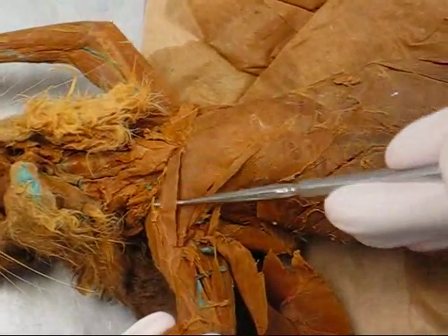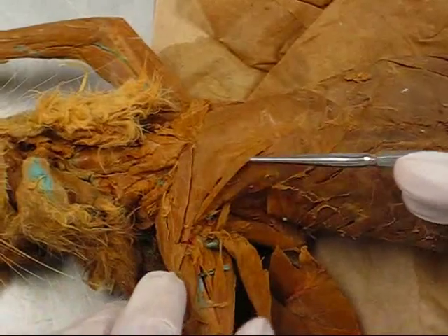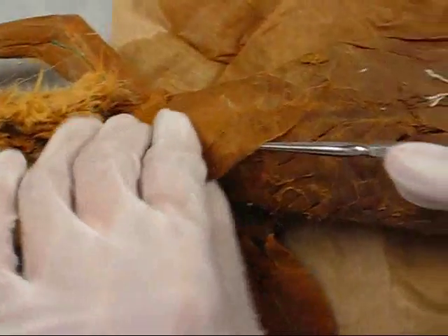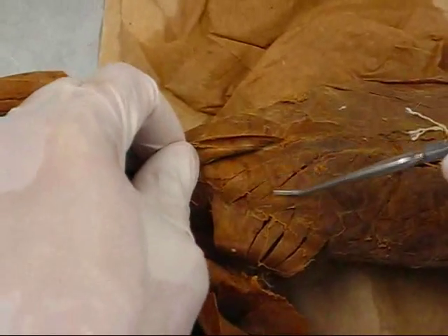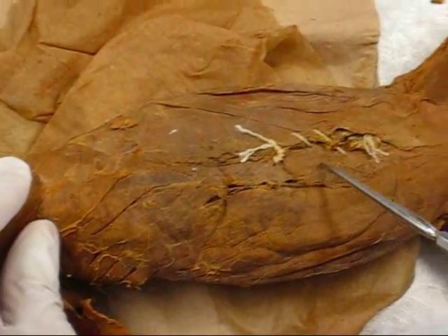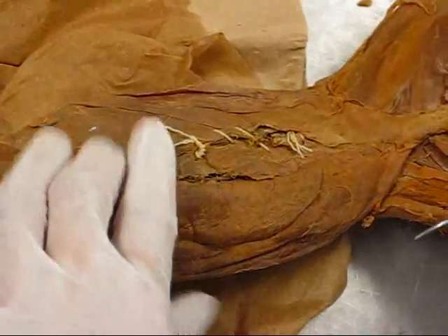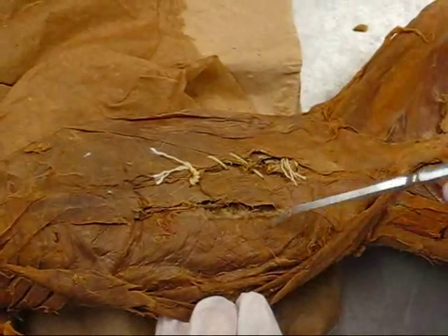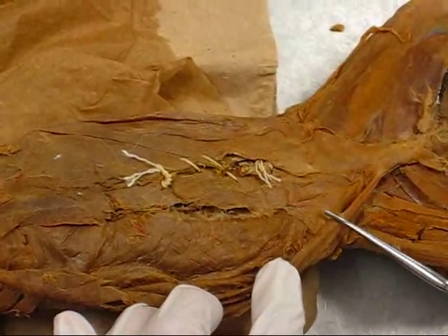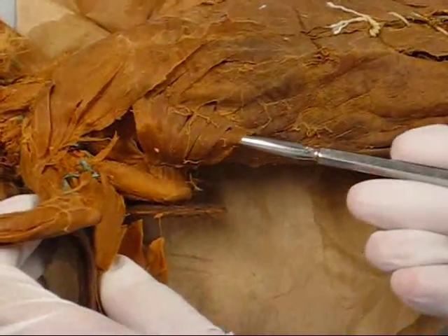This is the pectoralis minimus, pectoralis major. Underneath you have the scalenus, rectus abdominis, external obliques, transverse abdominis, the internal obliques, and serratus ventralis.